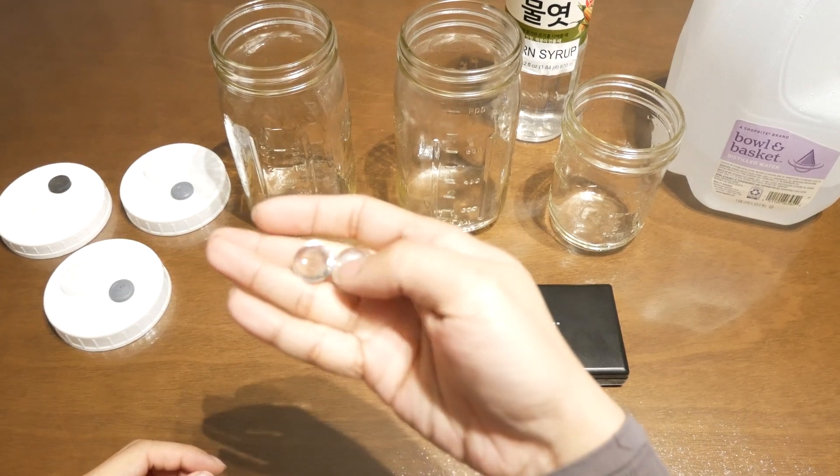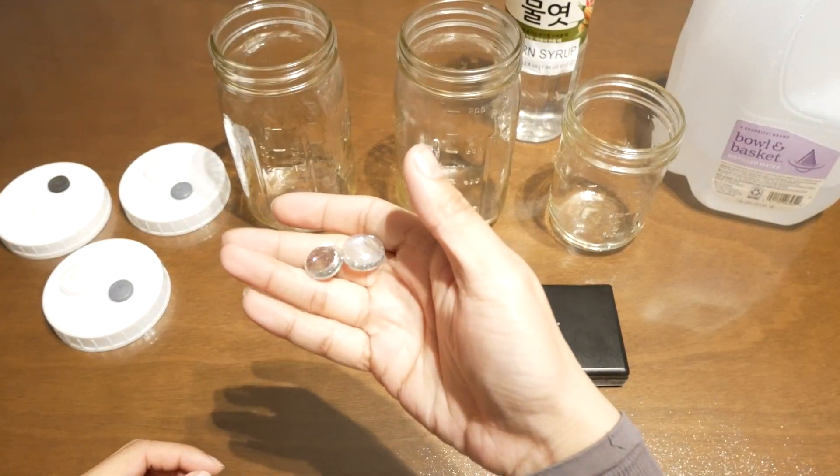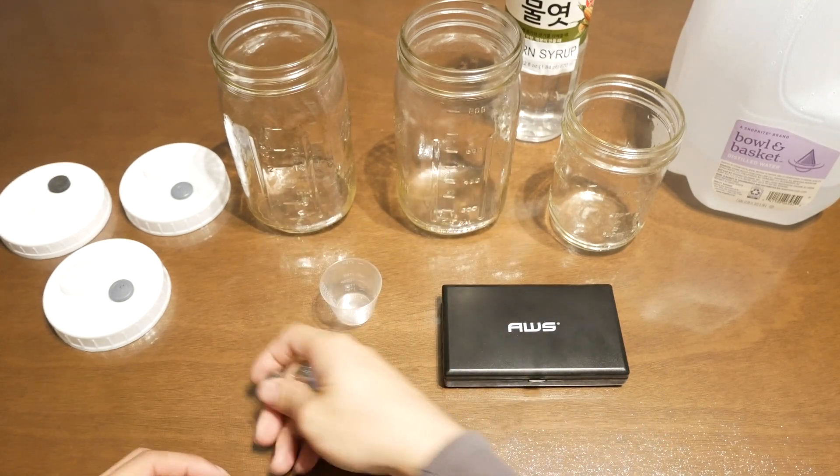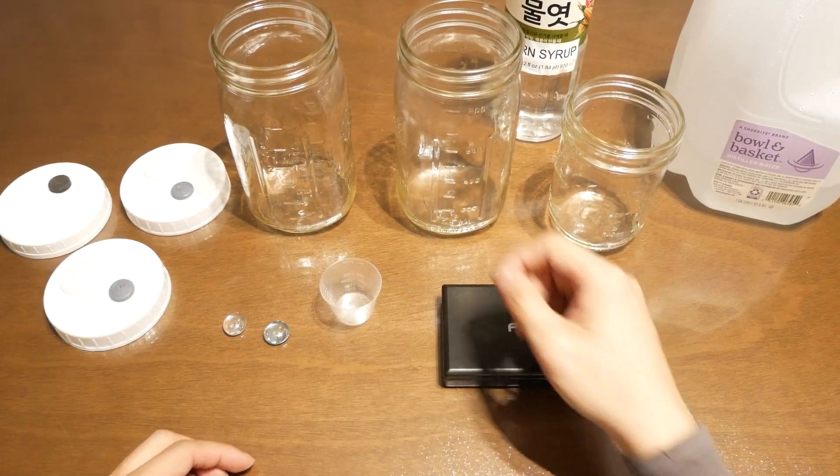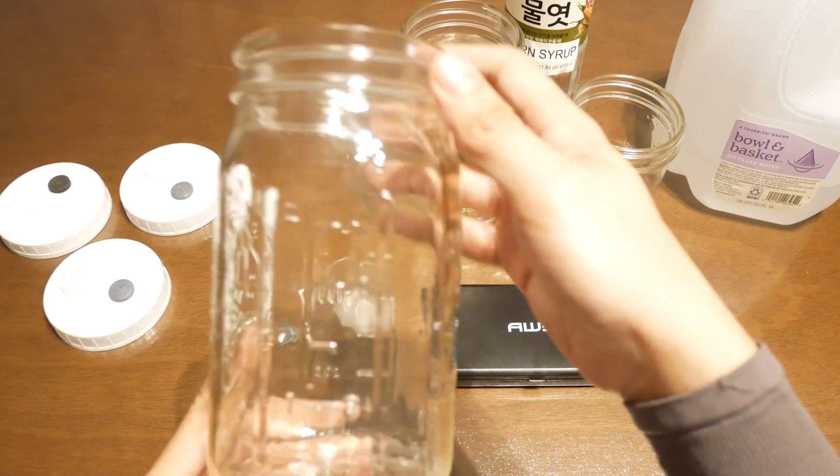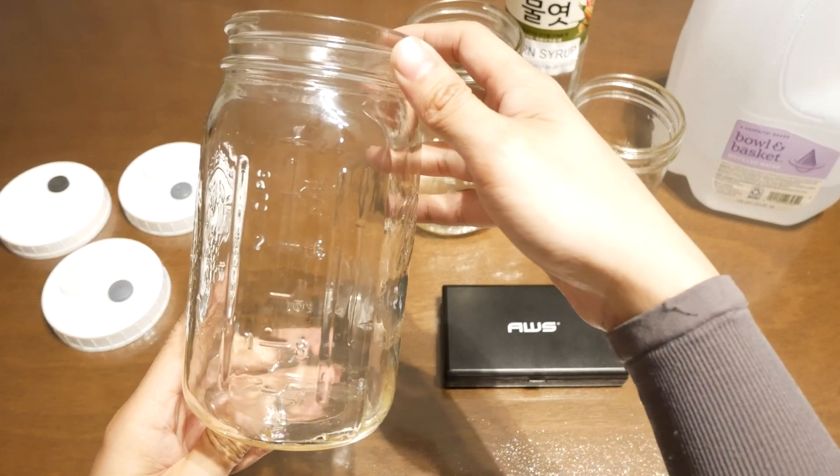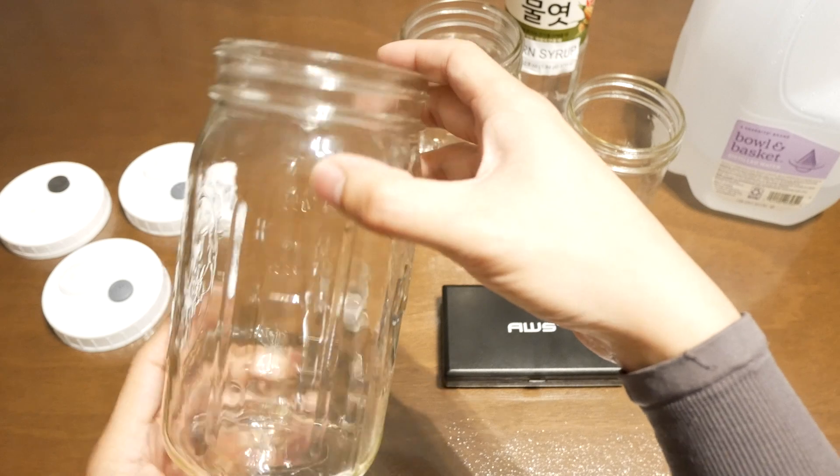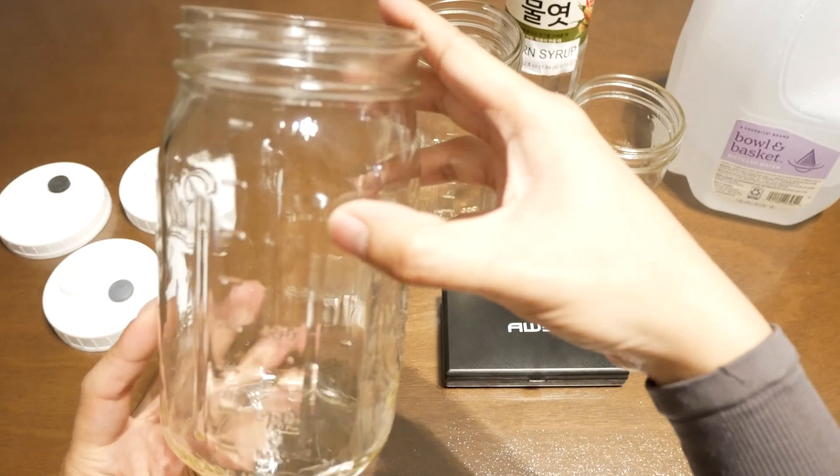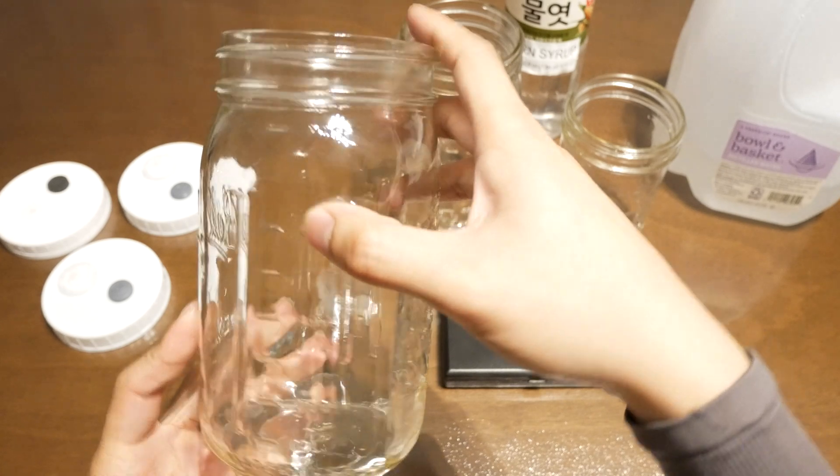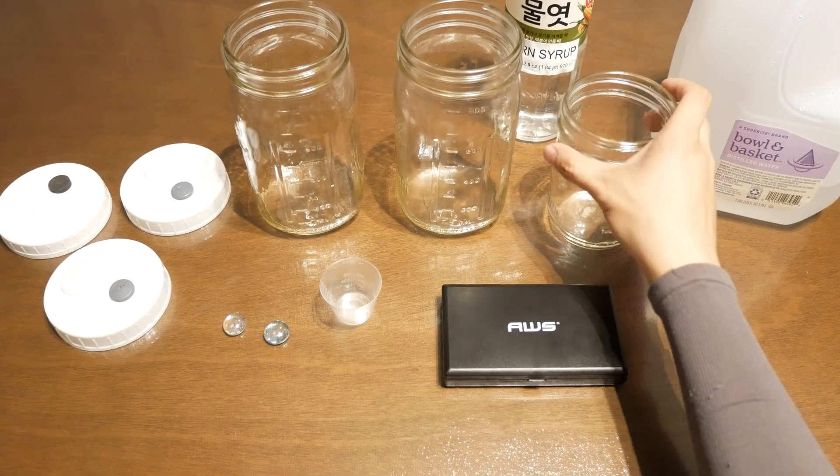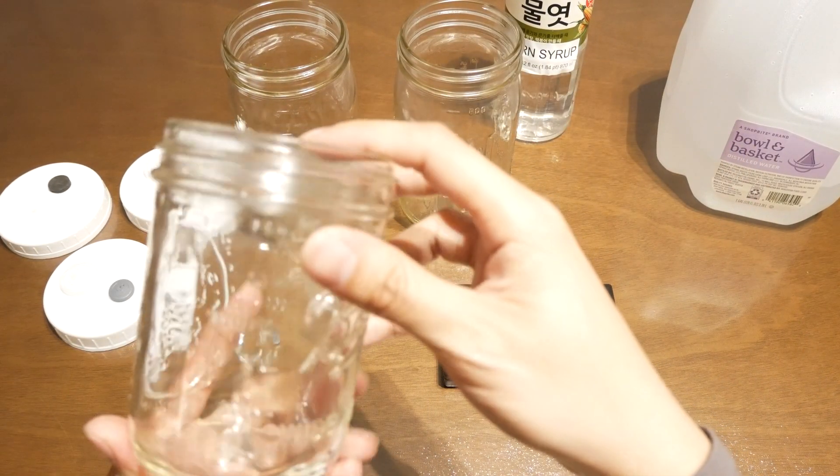You're also going to want some type of agitator. You can use magnetic stir bars, pieces of glass. Today I'm using two marbles. This is to help stir up the mycelium during the colonization phase. You're also going to need your glass mason jars. Whatever container you want to use to hold your liquid culture in. I'm going to be using quart jars and pint jars for today's example.